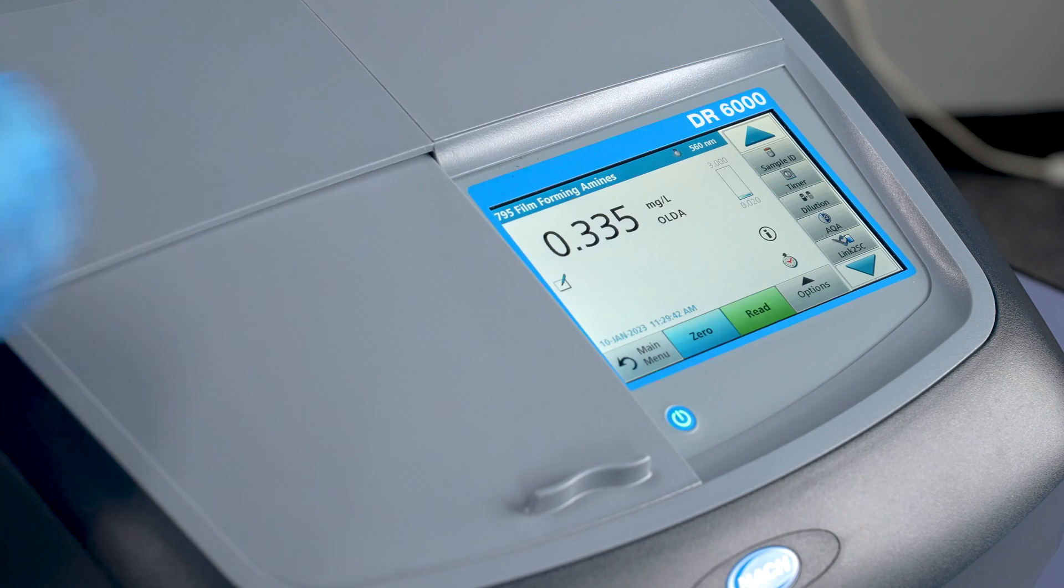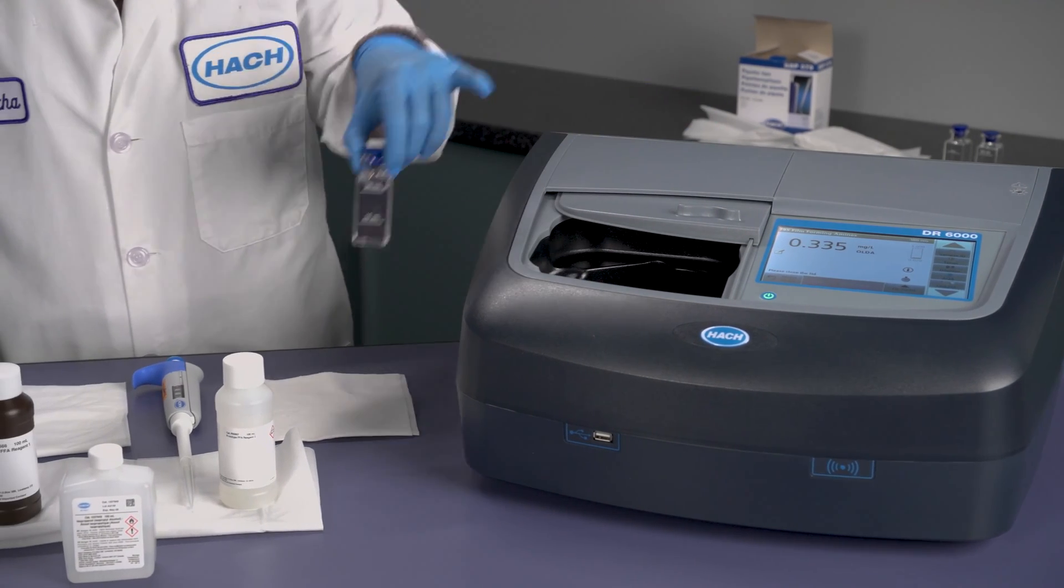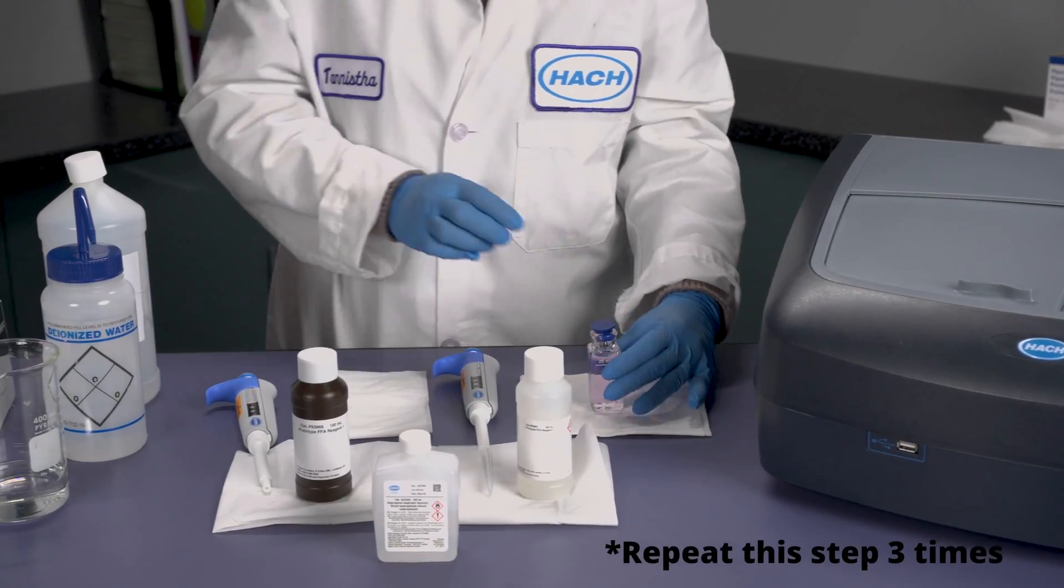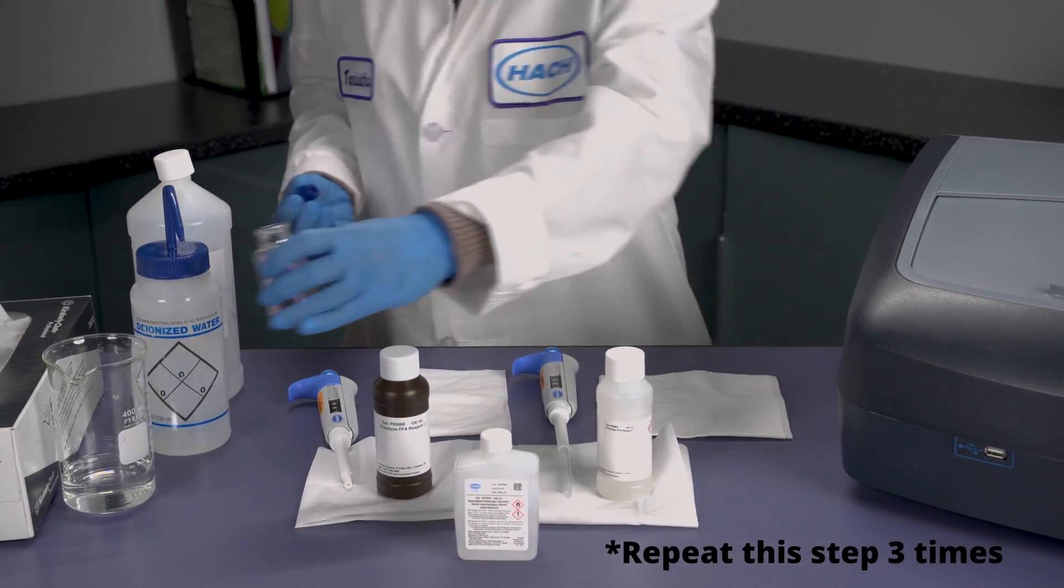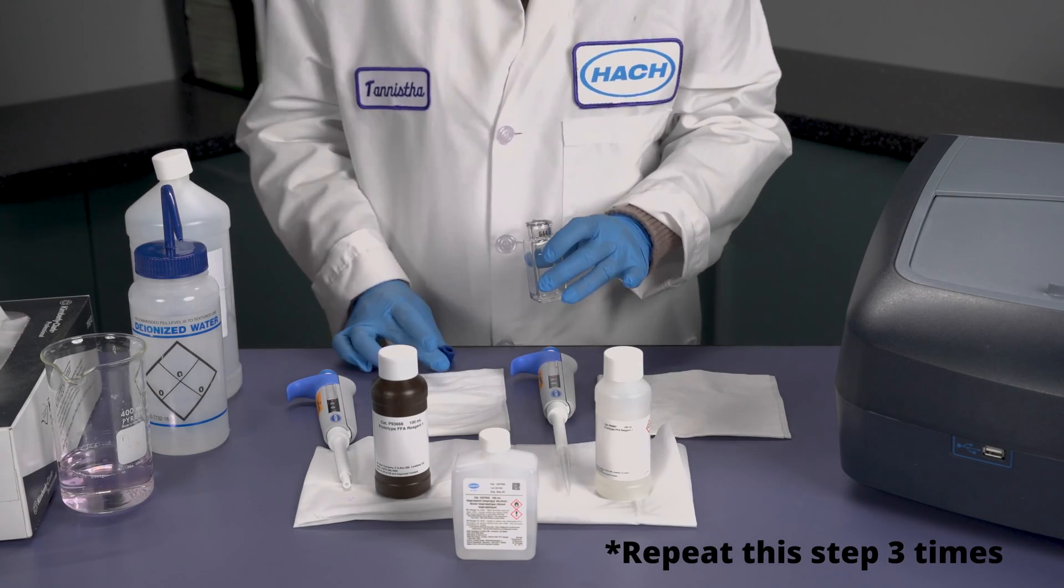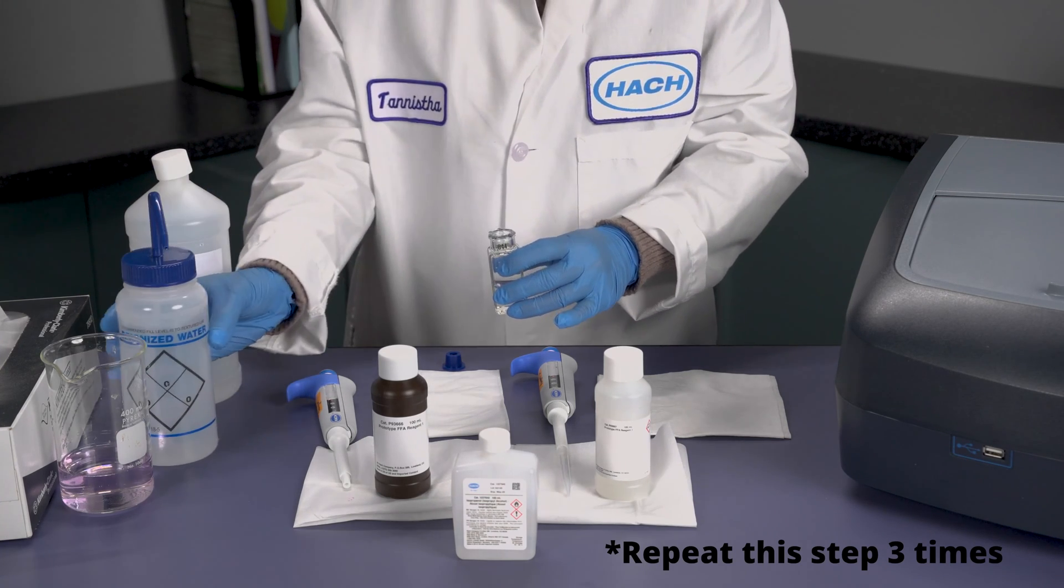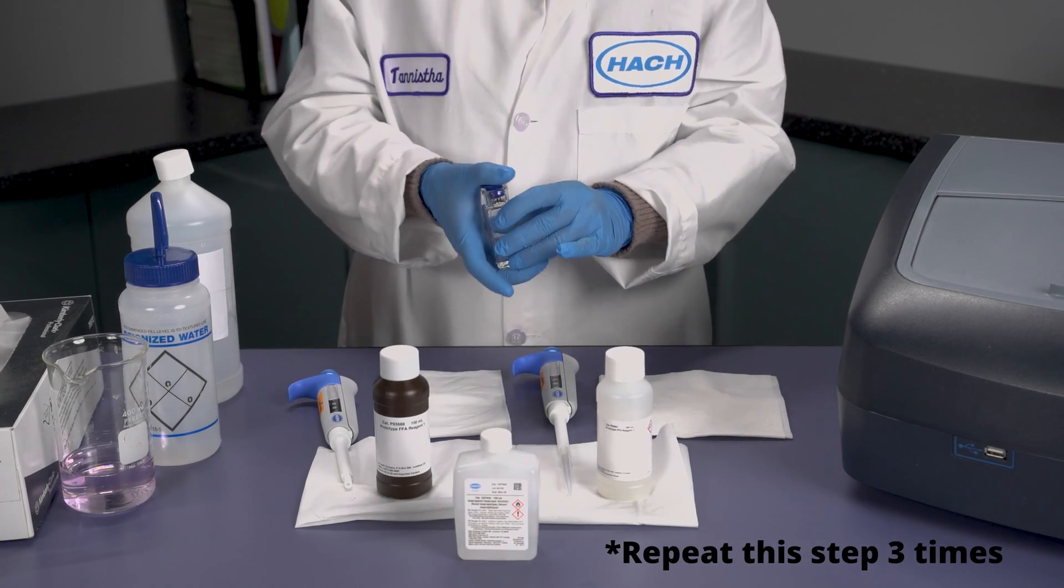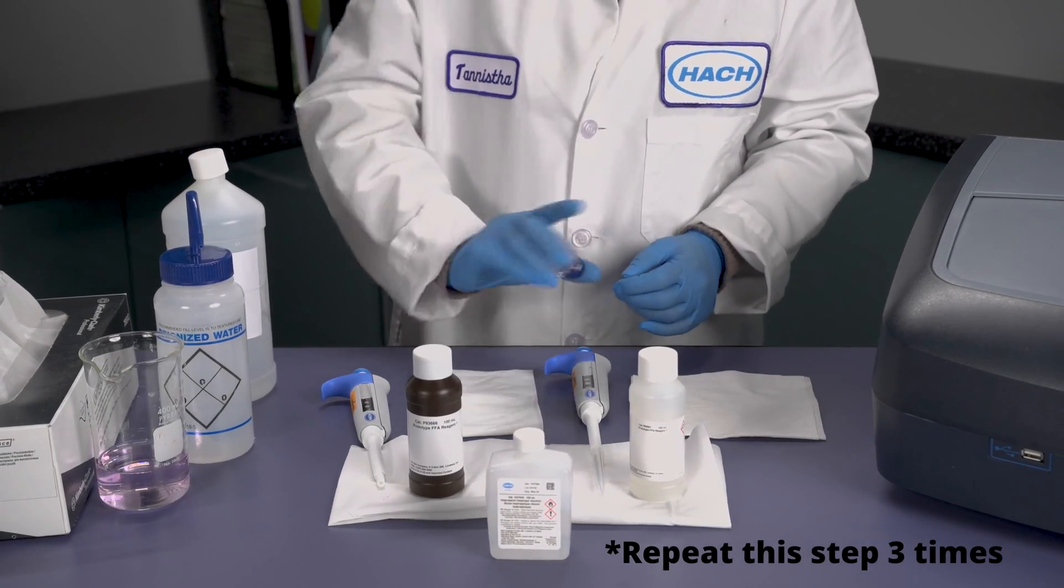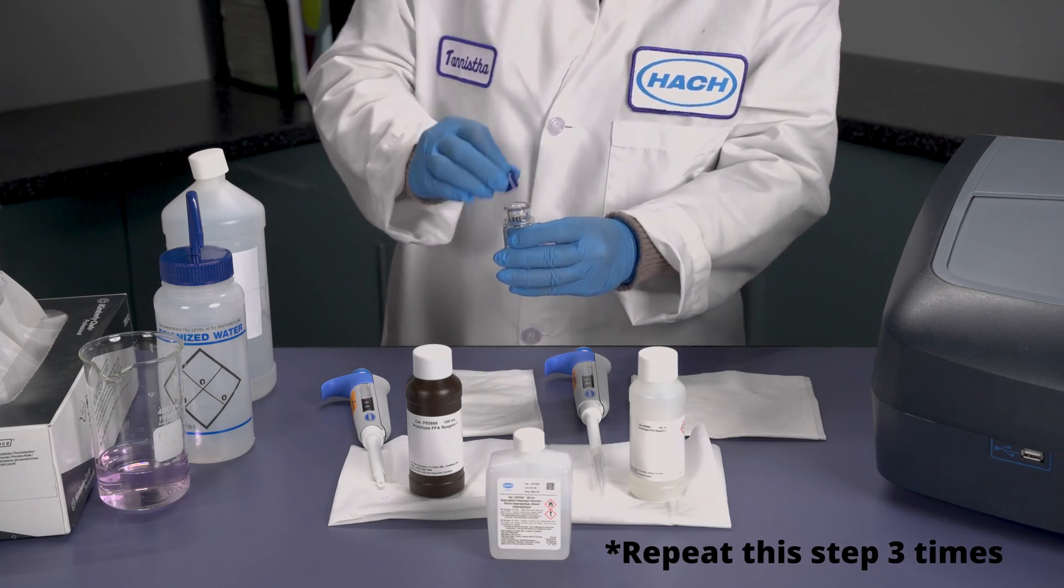Once you have your reading, it is important to very quickly clean your sample cell. Take the sample cell, empty it from the sample, and rinse the sample cell three times with deionized water. It's very important now to start shaking. We only invert during the test, but in cleaning, it's important to shake vigorously.